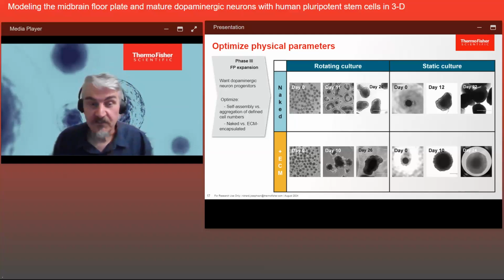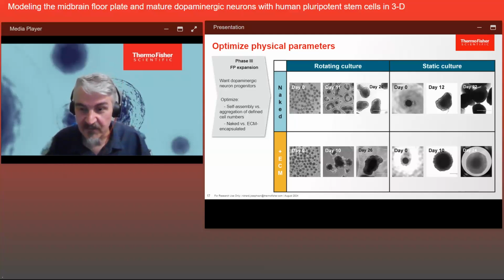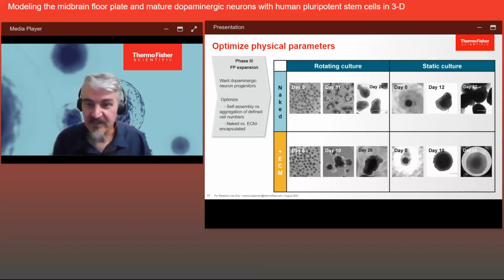In contrast, when we add dilute 2% Geltrex to microwells, it produces a similar but more modest epithelial outgrowth, which you can see in this image labeled day 10. There is a ruffle of epithelium, but it doesn't extend as far as it tends to from the encapsulation.